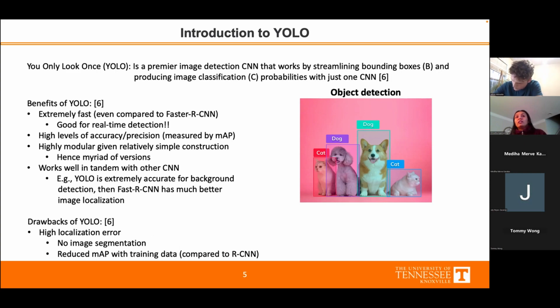It depends on the data that you provide, and you know that our voids are, say, 20 nanometer by 20 nanometer. So we define anchor boxes. When your model predicts your bounding boxes, it optimizes with respect to those predefined boxes. It just helps in computation because something of that shape is already predefined.